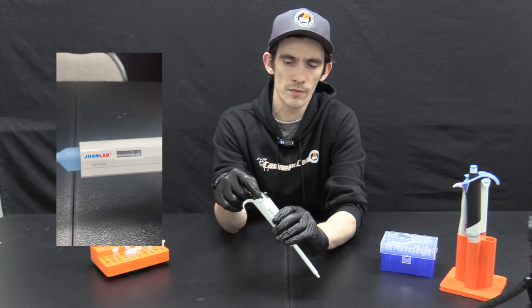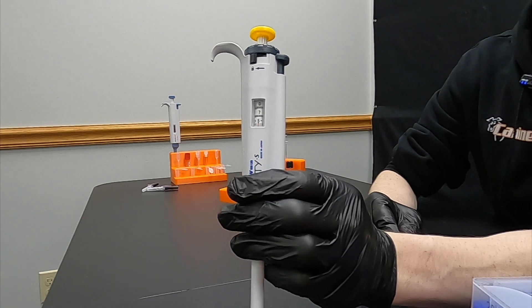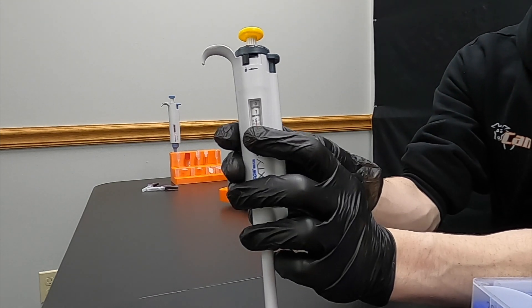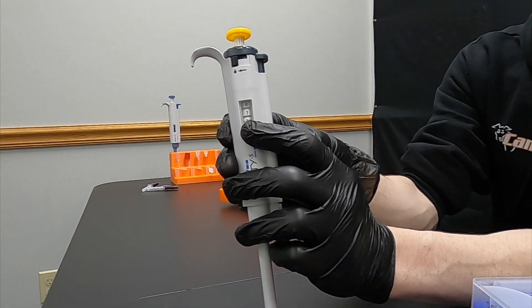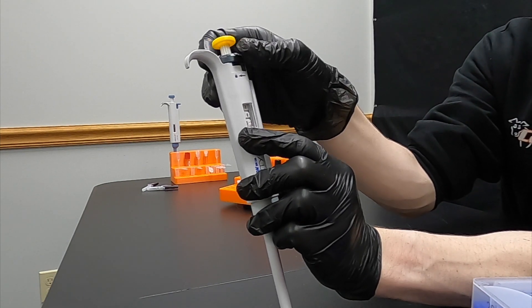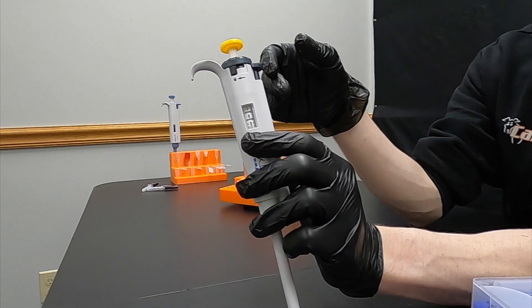Set it to the required volume for your test. With most if not all pipettes you're going to read the volume from top to bottom. With some you may also read the volume from left to right. In this instance, this is a 20 to 200 microliter pipette. We have a 075, which corresponds to 75 microliters. Let's change it to 100 — you'll see that top number change indicating we are at the 100 microliter mark.